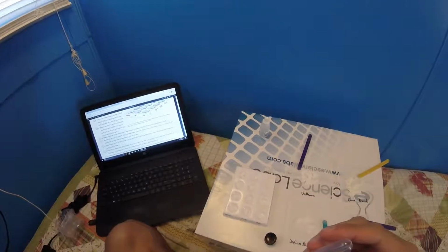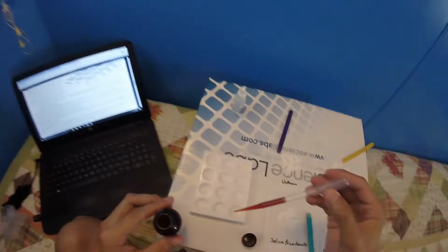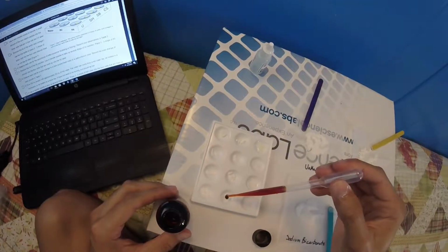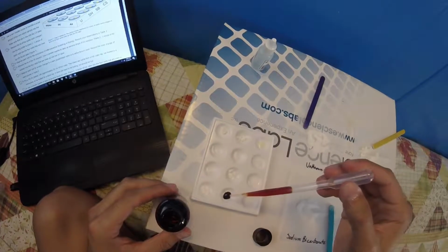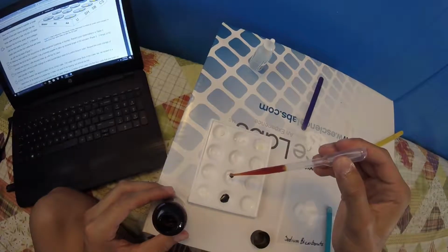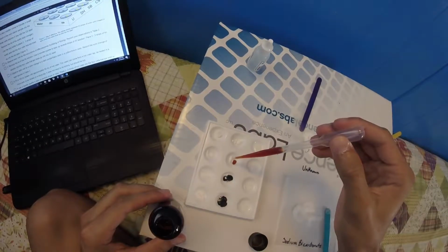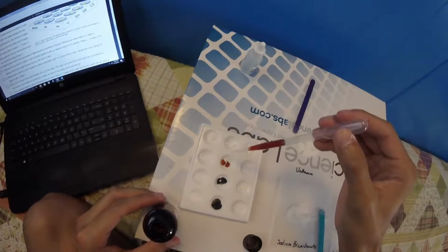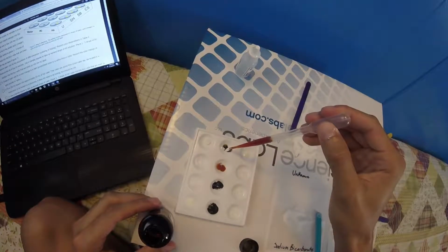And put several drops, 2 or 3, in the 4 wells that are lined up with the IKI, which would be this one. 1, 2, 3. 1, 2, 3. 1, 2, 3. 1, 2, 3.